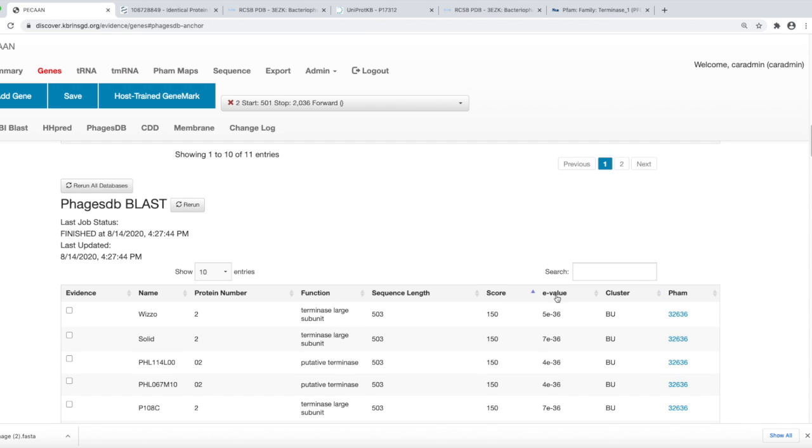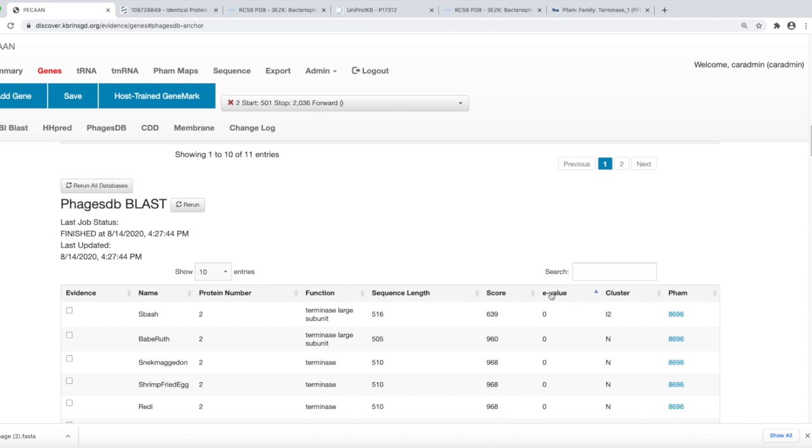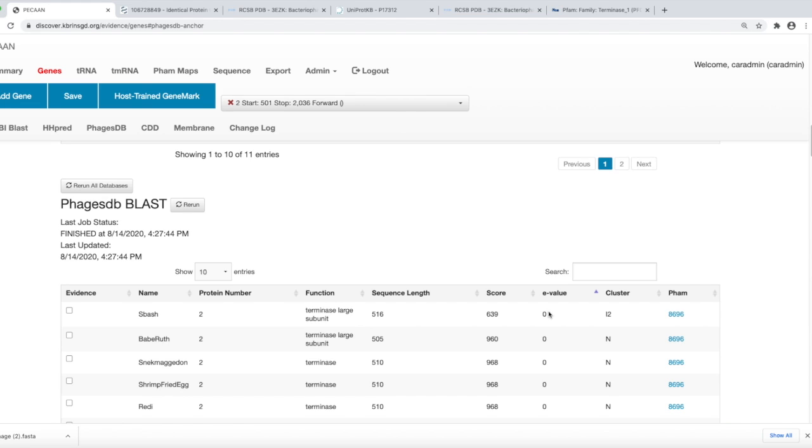E values are what's used to score the significance of the different database hits. If you have E values that are zero, for example, those are your top hits. E values can be as large as 0.05 and still be significant. Anything bigger than that becomes less likely to be a valid support hit.